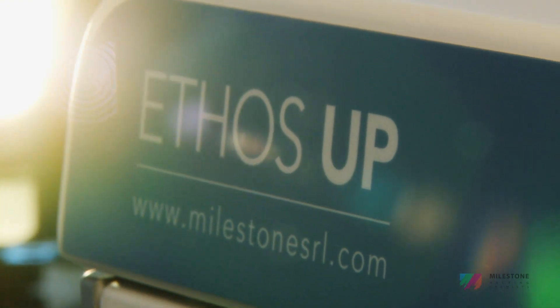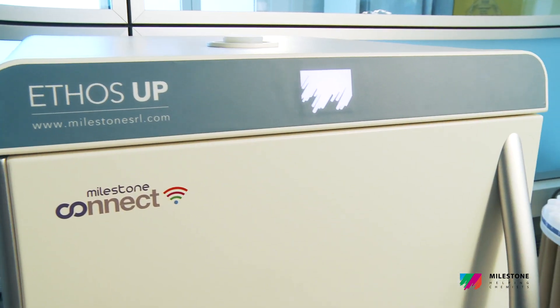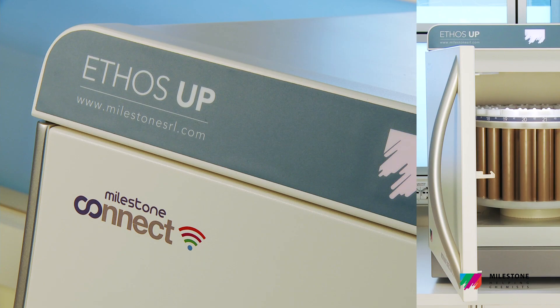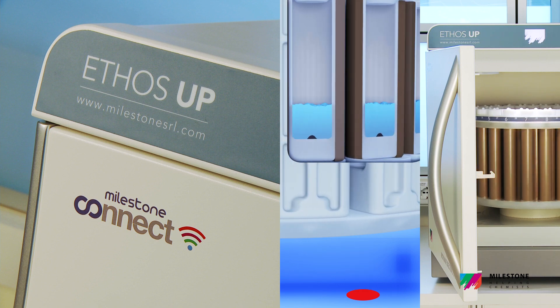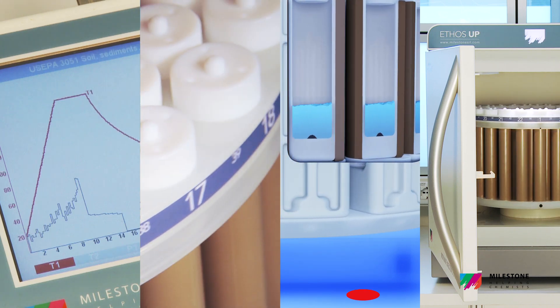The Ethos Up fully embodies milestones, philosophy and knowledge in microwave sample preparation. Specifically designed for closed vessel acid digestion, it offers a perfect combination of rugged hardware, an advanced and easy to use contactless temperature sensor and superior rotors, fully controlled via a user-friendly interface with intuitive software.